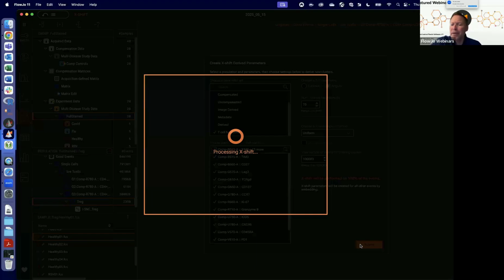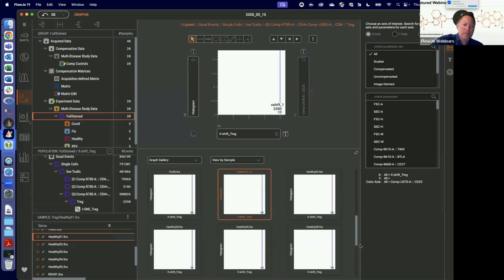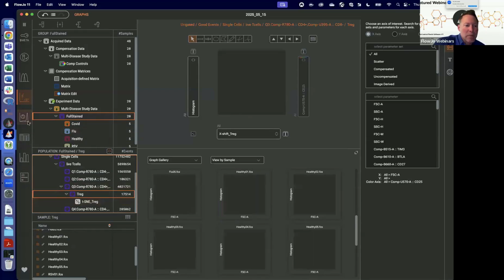Okay, I guess back to Edgar. I didn't answer your question fully or particularly well. Oh, one X-shift cluster. Hmm. Oh, I did not run it on the VCP. Let us run that on the virtually concatenated population while we talk.